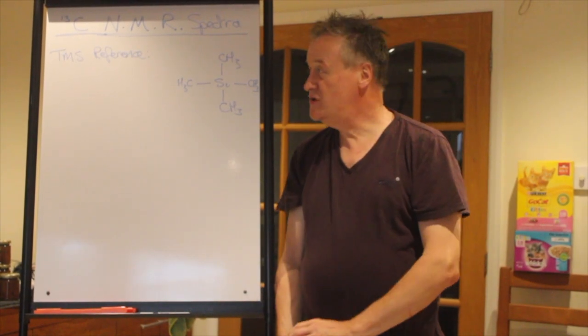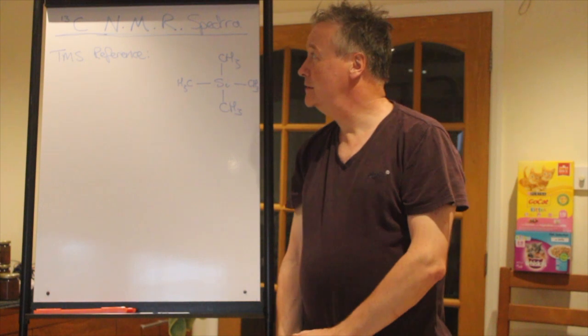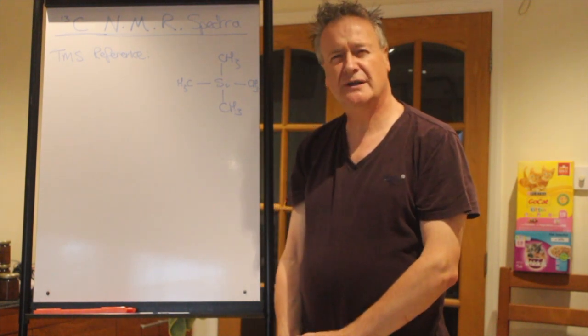So here we are with the second of the NMR. This time it's carbon-13 and we're looking at the spectra of those.